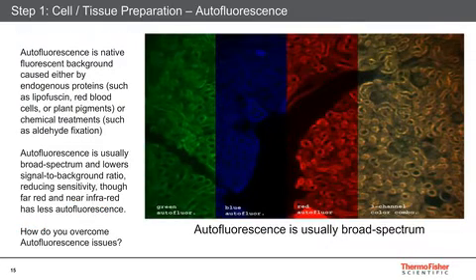Okay, so that's blocking. One last thing I want to talk about for cell preparation is autofluorescence. Cells, and particularly tissue, can have a certain degree of autofluorescence in them that can confuse your specific signal and lower your signal to background. Here's an image taken at 3 different wavelengths and then combined of a kidney section, just for its native autofluorescence. And you can see in every color there's a certain degree of autofluorescence there. You don't want this, definitely.